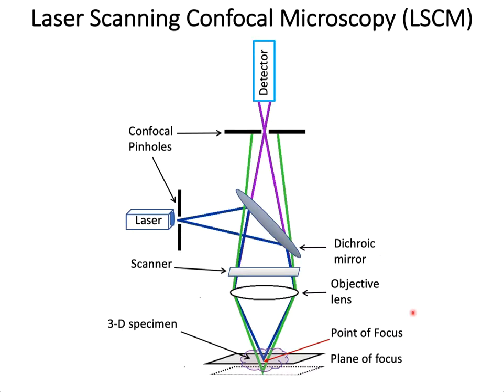So here is a diagram showing the concept of laser scanning confocal microscopy. It is very simple and elegant. The major advantage is that you can use a thick specimen and you don't have to section it, so you can preserve the three-dimensional information and collect 3D information on the sample. Confocal laser scanning microscopy uses a series of pinholes and mirrors to focus a laser light point by point onto your specimen and at the same time rejects out of focus light.